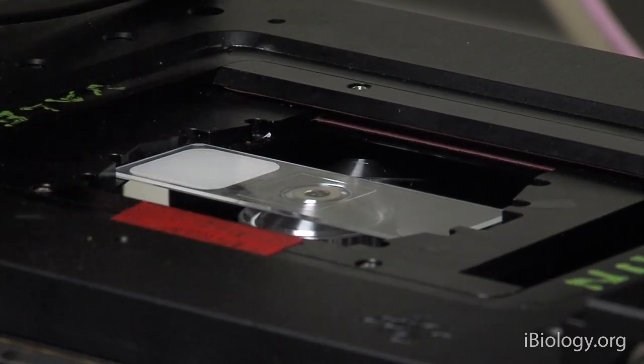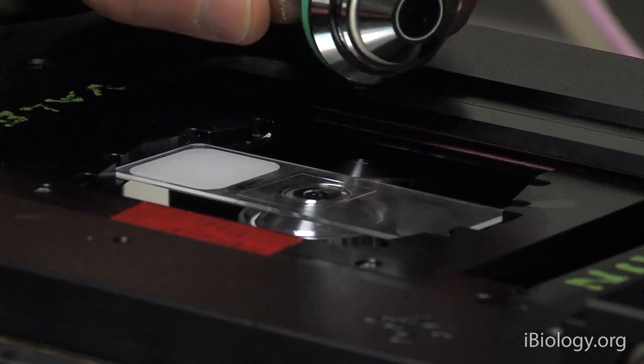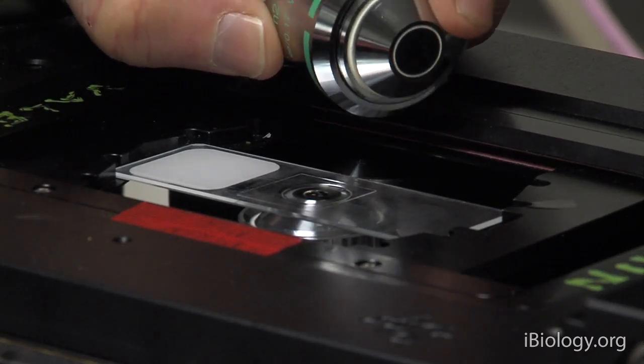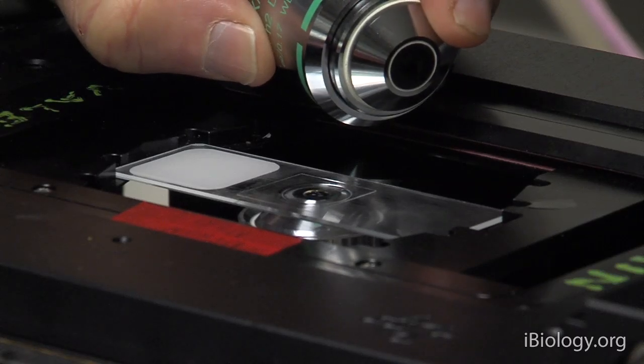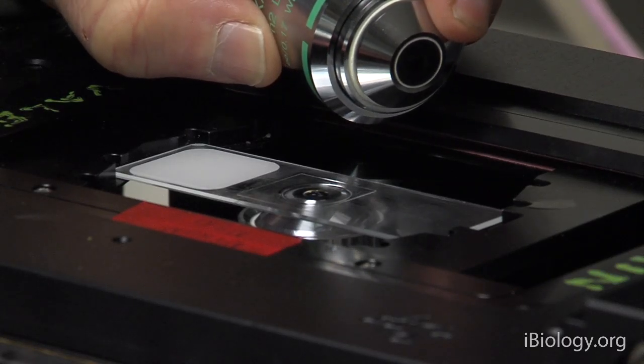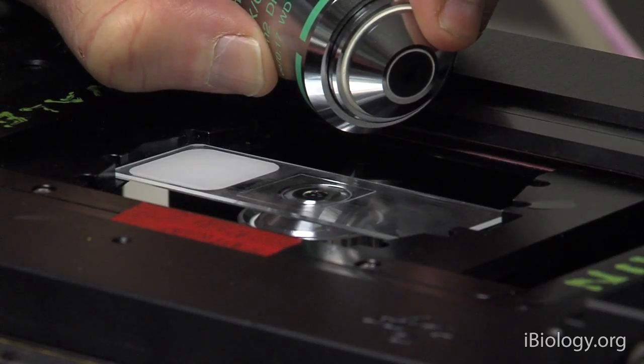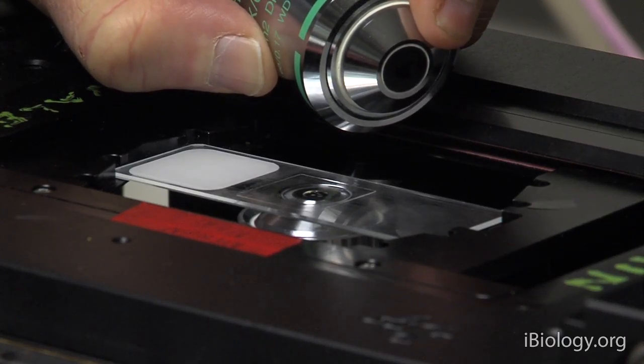And second of all, another thing that helps protect these objective lenses is a spring load that's built into the objective lens. So you can see this spring load here. So if it pushes against something, rather than just pushing on the objective lens itself, the spring load will go down.